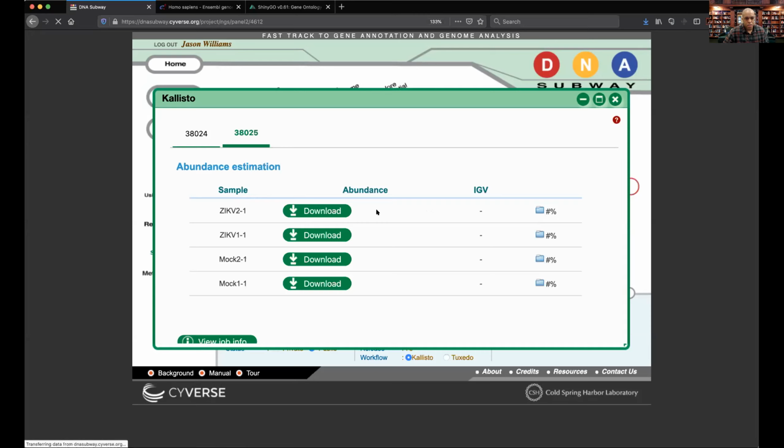And what it's going to do is download essentially a big spreadsheet. And we're going to just take a look at that and also define some terms. So I need to choose how I open this. So it's a TSV file. It's going to open it up with Excel.